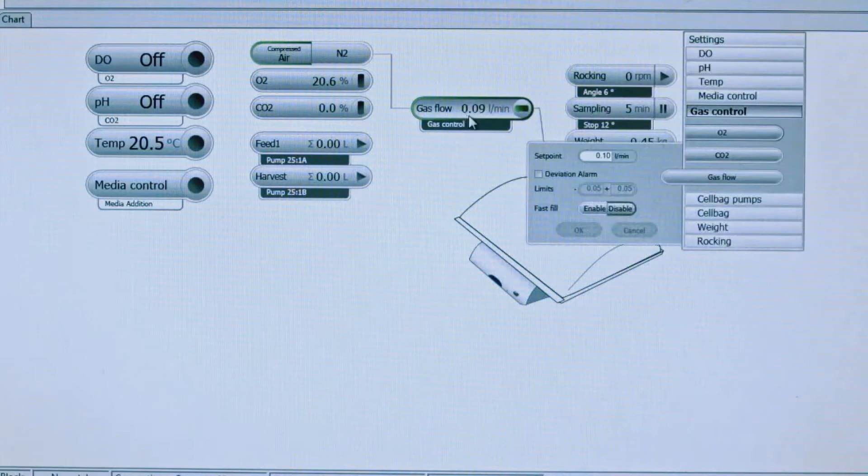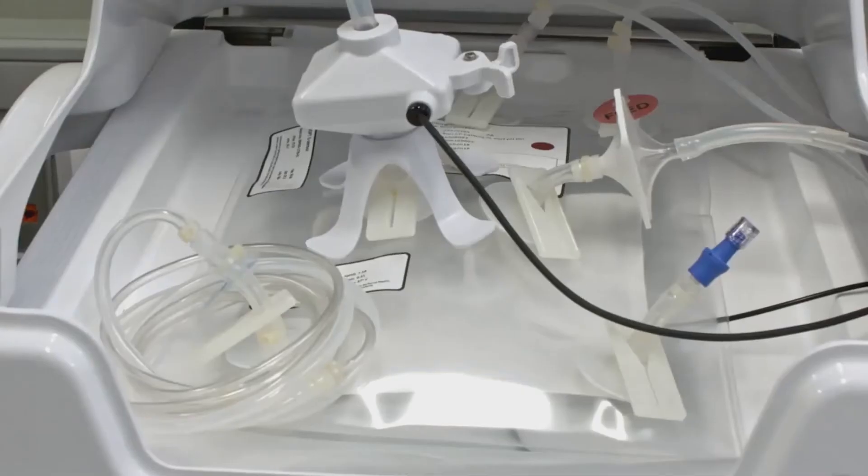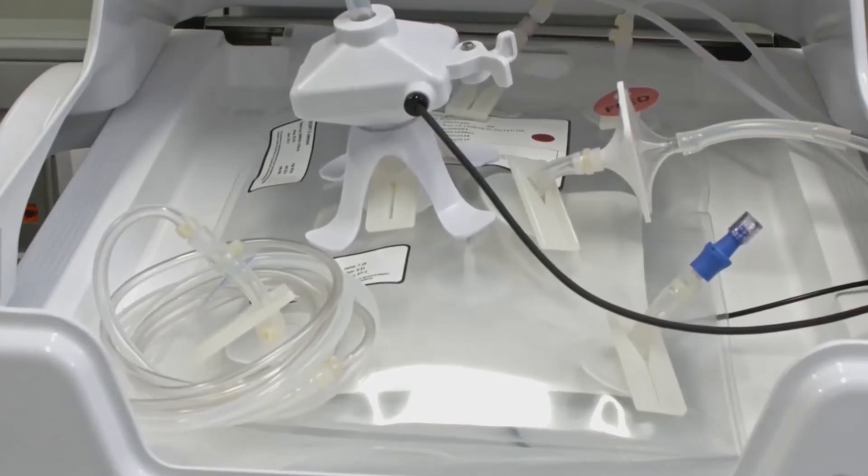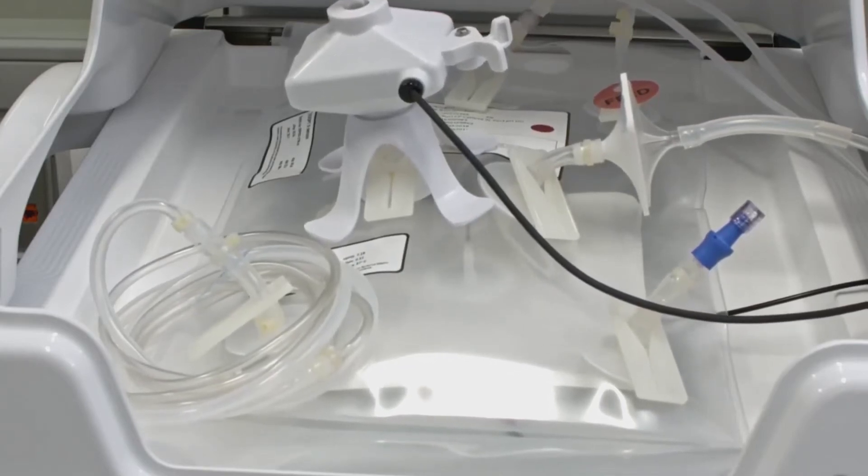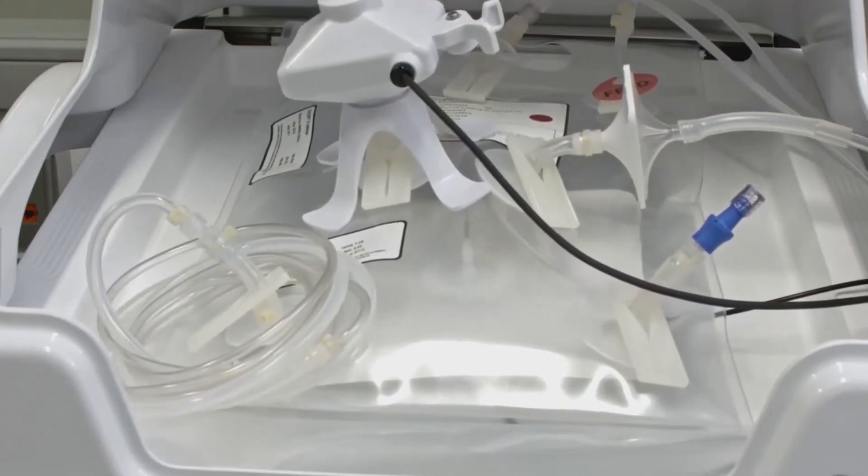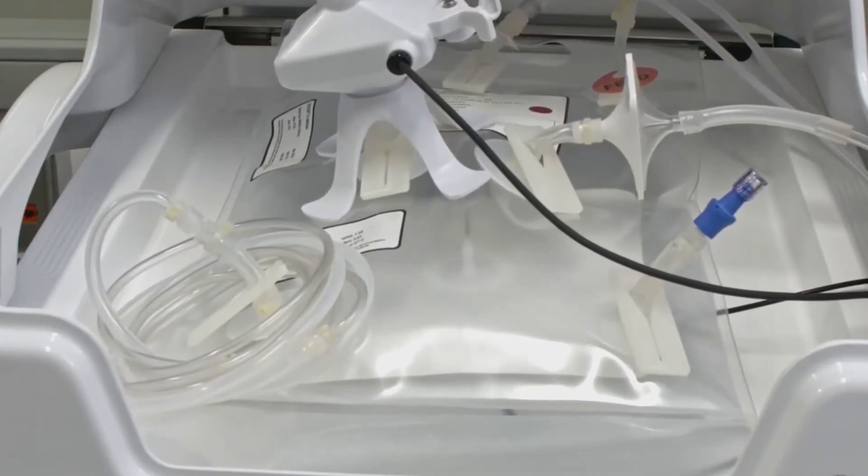You'll also want to enable fast fill, which will go from the 0.1 liter per minute set point to a 3 liter per minute set point for the gas flow into the cell bag. You can now set your CO2 to whatever set point you would like. Once fast fill is enabled, it will fill the bag with your mix of air and CO2. It will only last for 30 minutes and then it will automatically switch off to your designated set point of however many liters per minute you want. Fast fill will also automatically crack the check valve so there is no need to press on the bag.